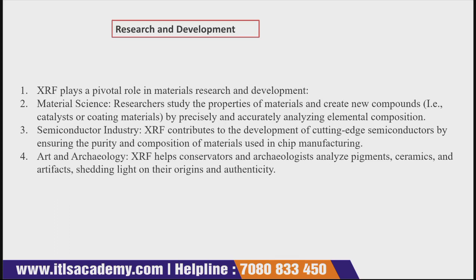Art and archaeology we have already discussed, so it has huge application in every field. In examinations they can also ask you how X-ray fluorescence spectroscopy has different applications in research and development. So you can tell all these 4 points.